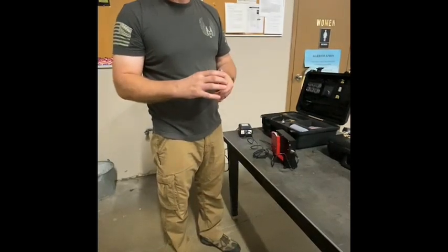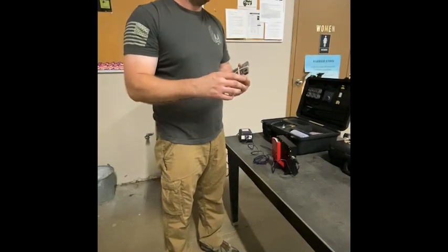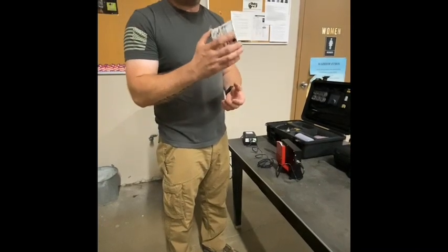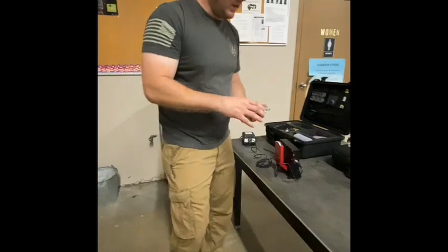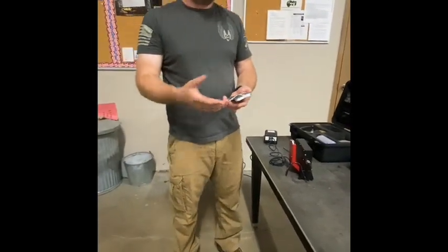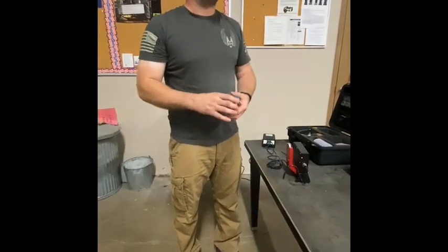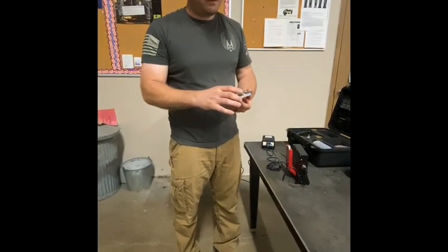a couple minutes, because any contact with air, your skin, especially if there's a humid day, all those things can throw off your numbers. So you want as little contact with these pads as possible with outside atmosphere. Anyway, when you open it up, it's got a yellow side and the white side. So the yellow side is a dye, the fuel has a reaction with the dye. And that allows you to find out how much free water is in your fuel.